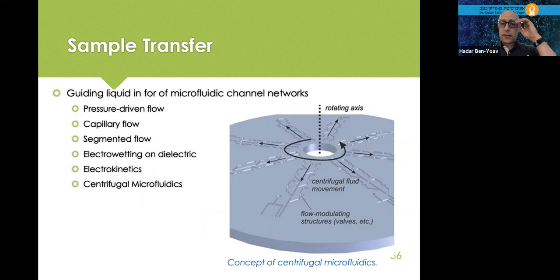You can also have centrifugal microfluidics. This is the example I told you about, the disc idea. At the beginning, we take a compact disc, like for listening to music, and make different types of channels on top of it. You put the sample here, and put it in the microdisc or the centrifuge. The centrifuge is circular and moving, and due to the centrifugal force, the solution flows from this area to this area. And here it goes through different mixing structures into the detector.